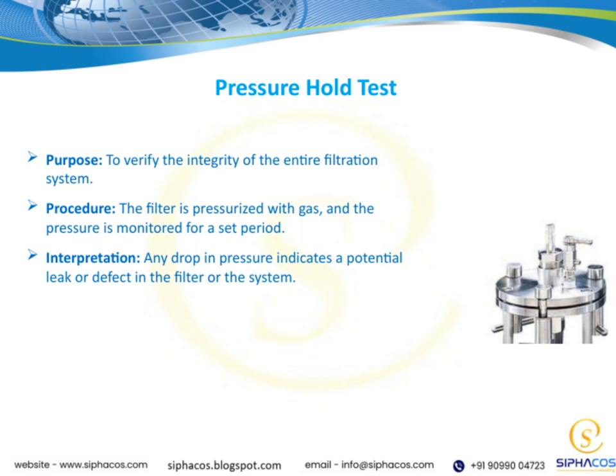Moving on to the procedure, what we do here is pressurize the filter with gas. This helps us simulate operating conditions and see how the system holds up. During this process, we monitor the pressure carefully over a set period. Any change or drop in pressure can tell us a lot about the condition of the system.